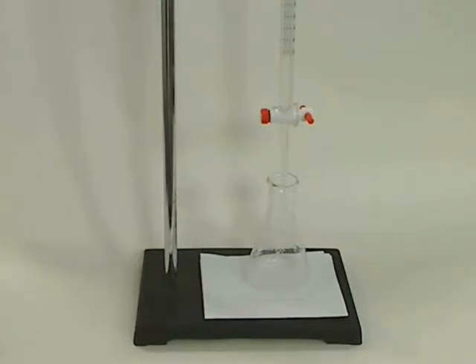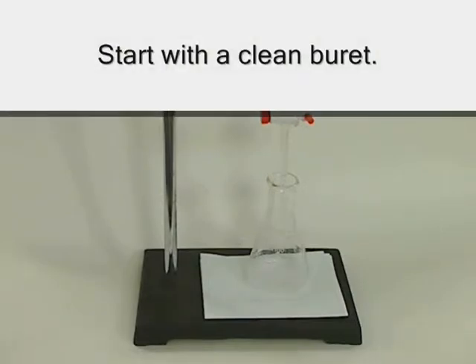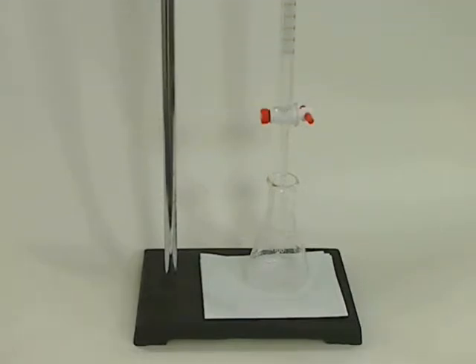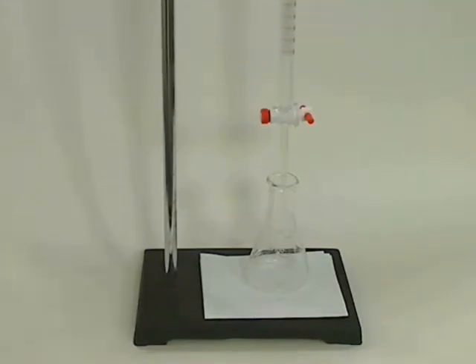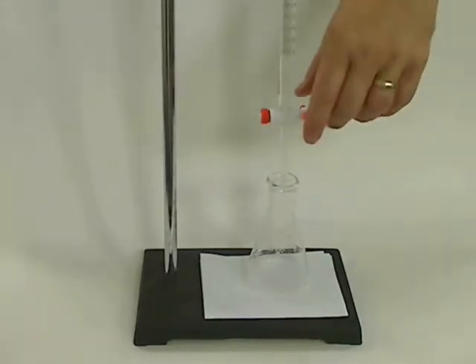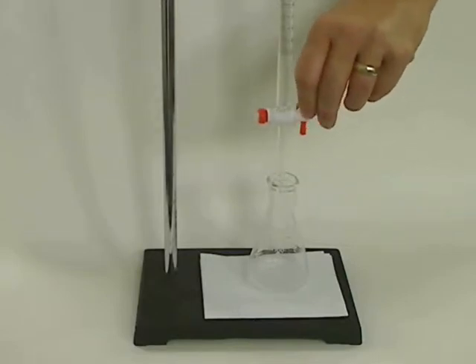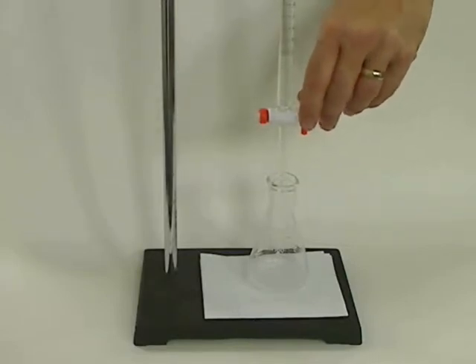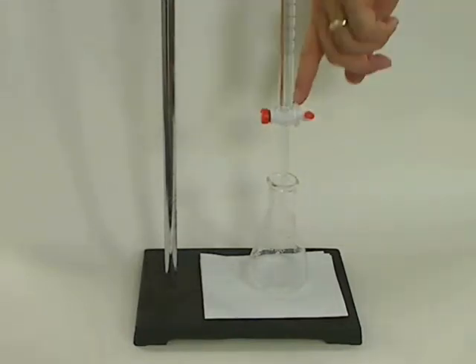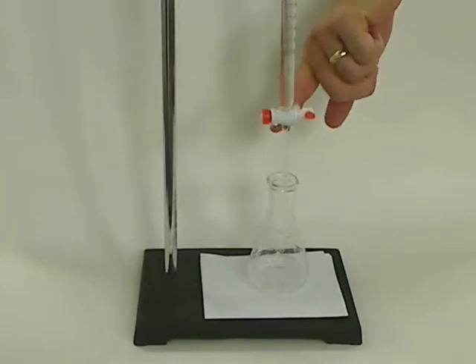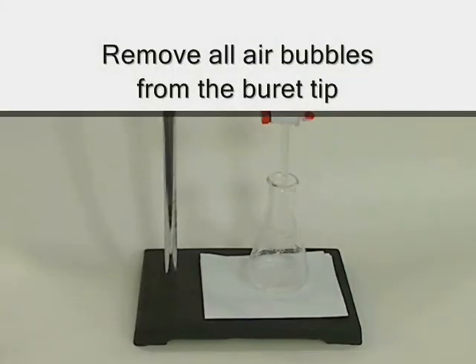The first thing you want to start off with is a clean burette, then rinse it several times with your titrant. You don't need to fill it all the way up. Add 10-15 milliliters, swirl it around, and make sure you let some of the titrant go out of the tip. It's important to thoroughly flush the stopcock and the tip with your titrant. This is also a very good time to get all the air bubbles out of the tip, and we'll talk about that in just a second.